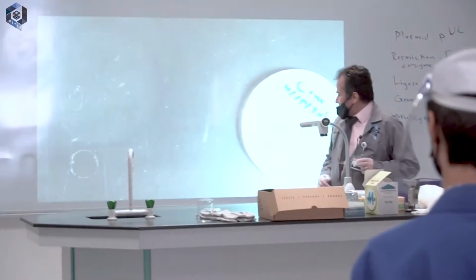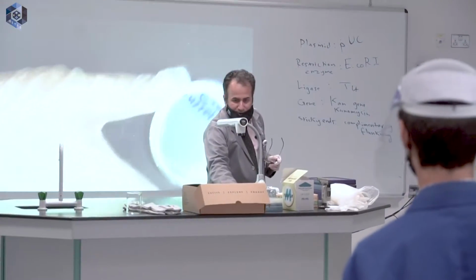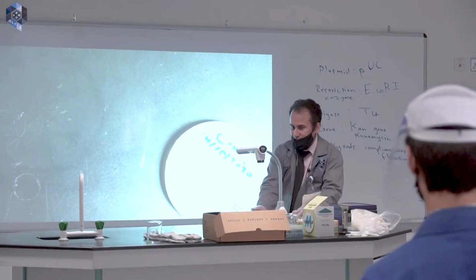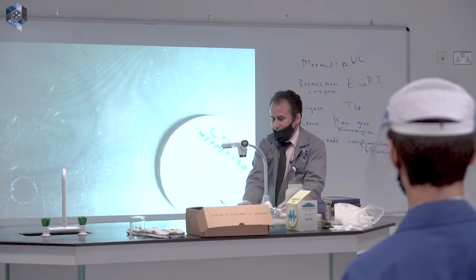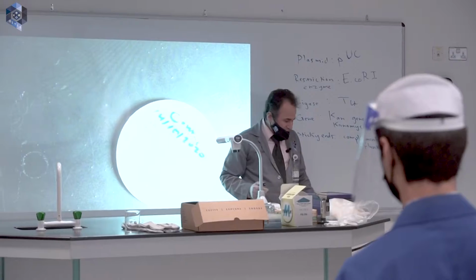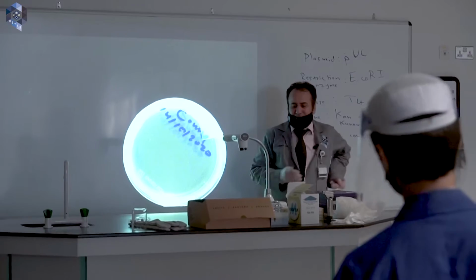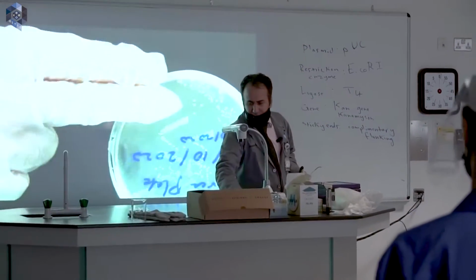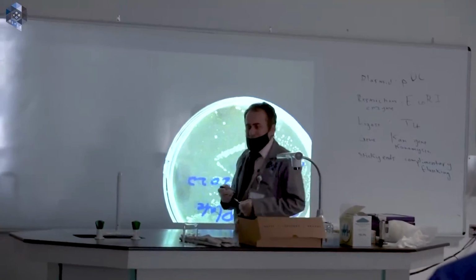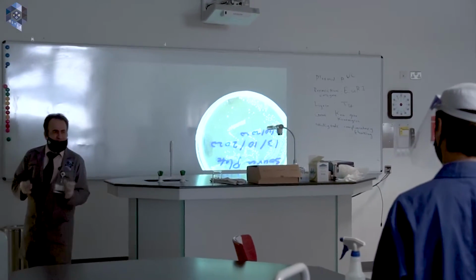Now, can you observe any growth in this plate? No. No growth in this plate compared to this one. Okay. Now, what do you think? Why did the smaller plate show no growth? What might be the difference? The critical thing?